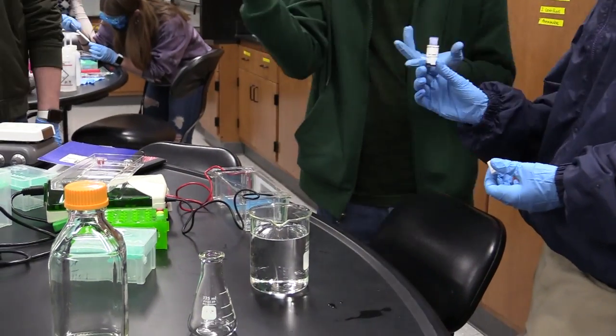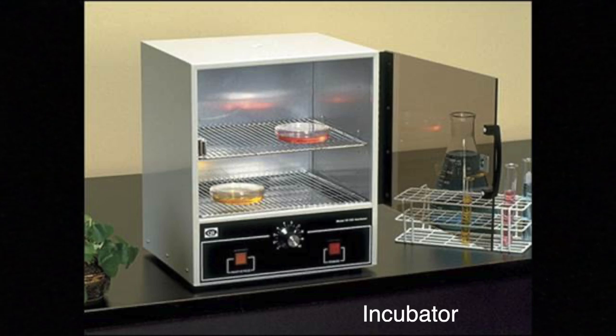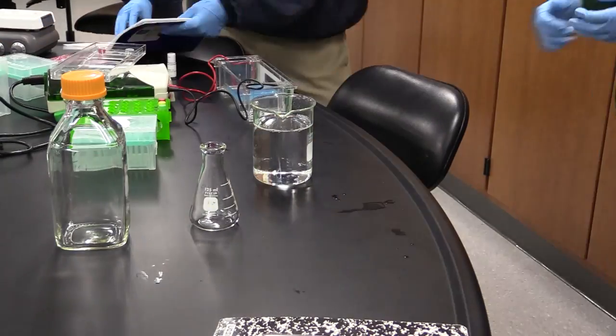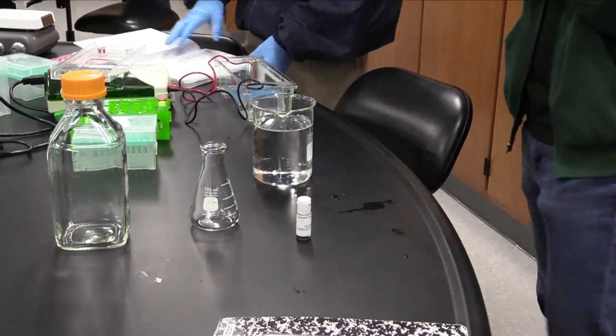Students then streaked their petri dishes with their bacteria with a sterile inoculating loop, put their petri dishes upside down in the incubator, and checked on them each class for a week to look for growth and contamination. Not only did students learn about growing bacteria, but they did so by using aseptic technique. Aseptic technique is important for preventing the spread of germs.